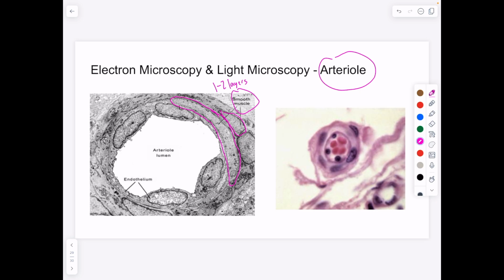We also know it's not a capillary because with a capillary, basically 1 cell would take up the entire cross-section of the capillary. So if it's not a capillary, it's not muscular. We don't see a ton of layers of elastic lamellae, so it's not elastic. So that pretty much leaves us with arterial. So process of elimination can guess that. Here's another arterial, very small, I think 1 to 2 layers of smooth muscle there. All right, so that's it.